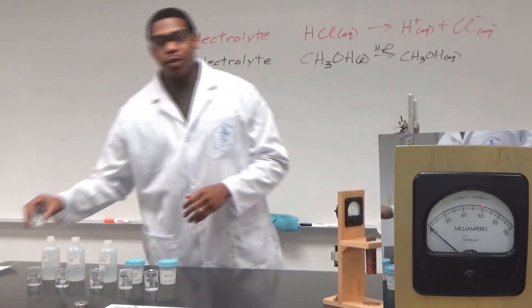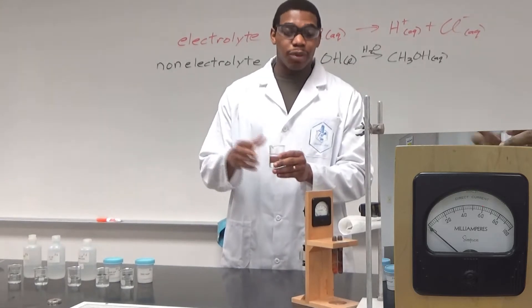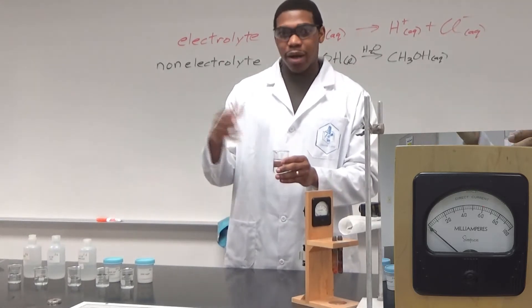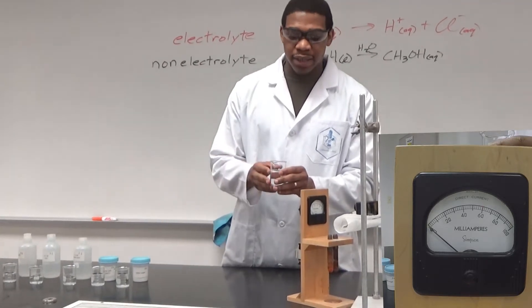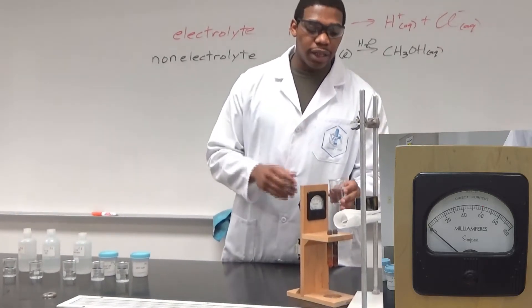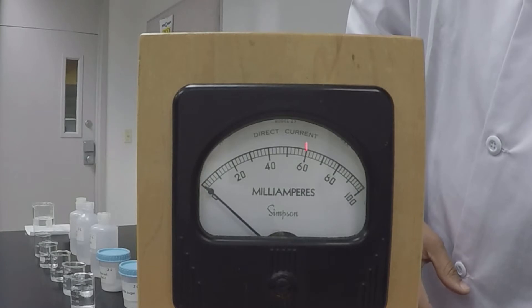Now with normal tap water, which can come from a lot of different sources, maybe there might be ions from the minerals in the rocks that can allow the tap water to have some conductivity. Let's go ahead and run this - we're going to give a little bit of up and down motion.